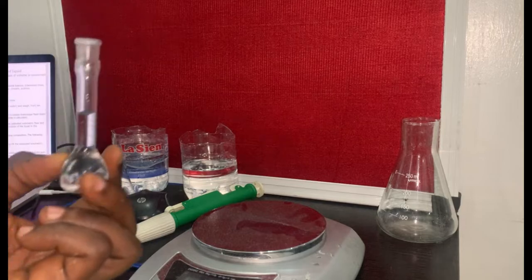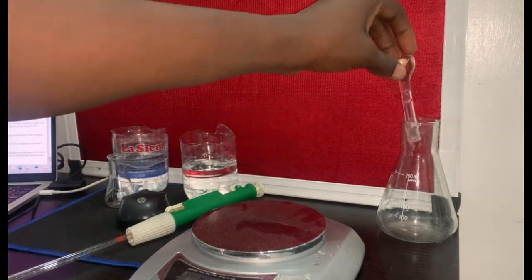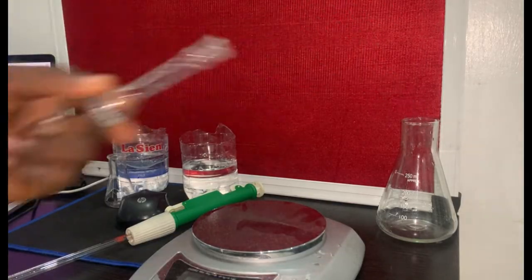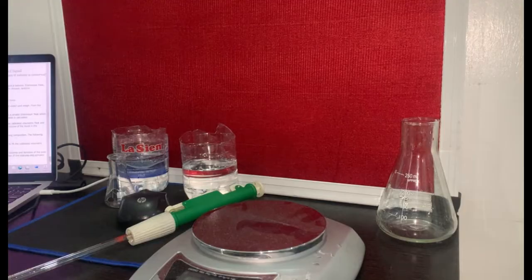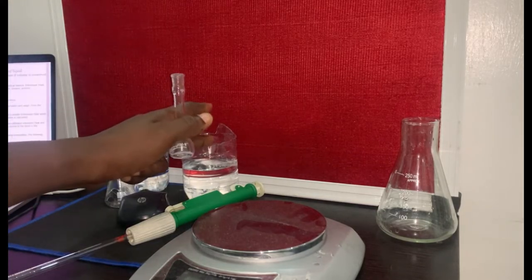All right, now I'll empty this into these flasks. Right, I'll empty this. Now procedure 3 said determination of density of the second liquid. The second liquid in this case is the ethanol. We do not really know the density of this, but we know the density of water from experiment 1.